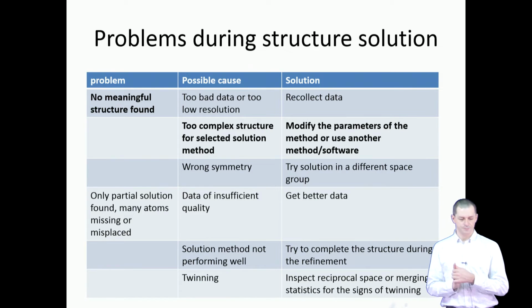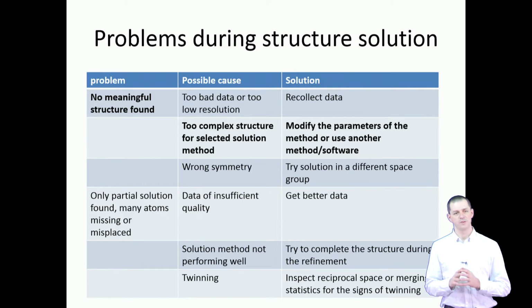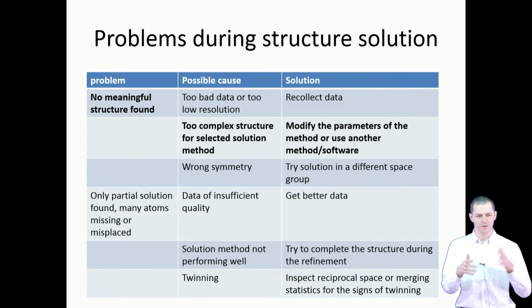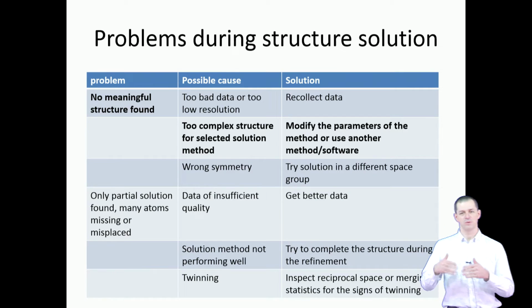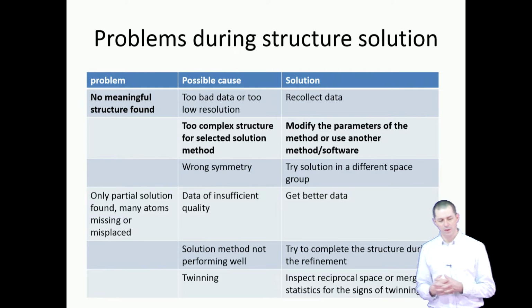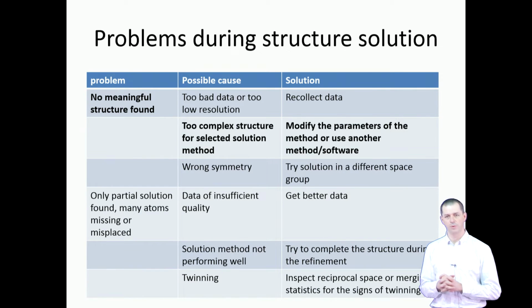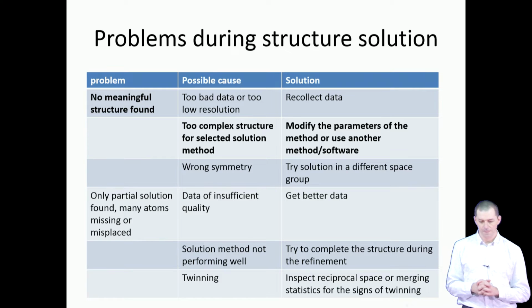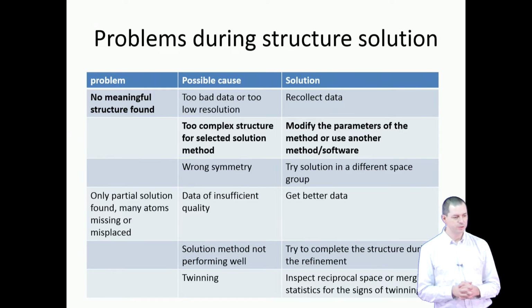The second branch is the family of SIR programs. So SIR, I do not actually know what is the very latest version, but there used to be SIR 2008, 2011, 2014. So there is every now and then a new version of the SIR program that is programmed or developed by the group in Italy, in Bari. This is also a direct methods program, but with many modern features.